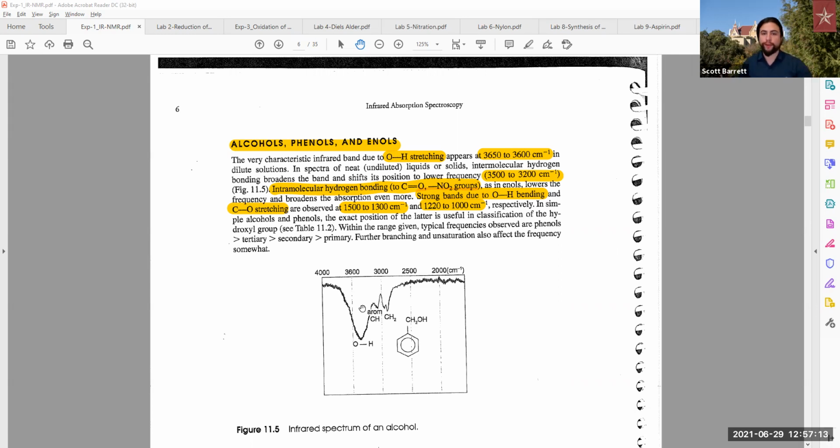And usually you'll see a very, very deep and broad trough there because the hydroxyl group is so polar. There's such a strong dipole moment of the electron energy going towards it. So that is the reason that it would be such a deep trough. And additionally, whenever you look at things like ketones or any carbonyl groups, they will have those deep troughs as a very noted situation.